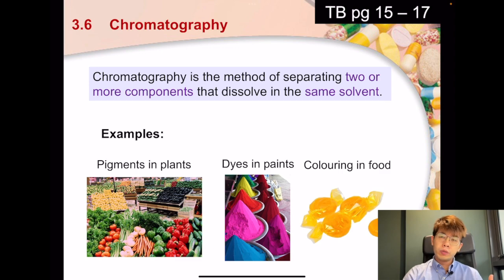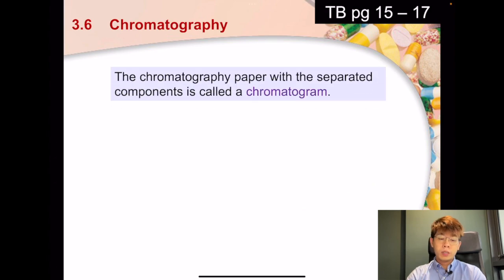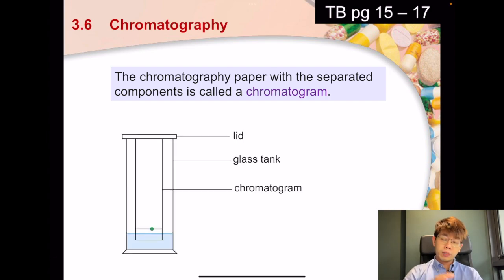Currently we look at all this, and it's colored compounds. So can chromatography actually separate non-colored compounds? The answer is yes, it can separate non-colored compounds. These compounds will be separated onto what we call a chromatogram, and this is how the setup looks like.